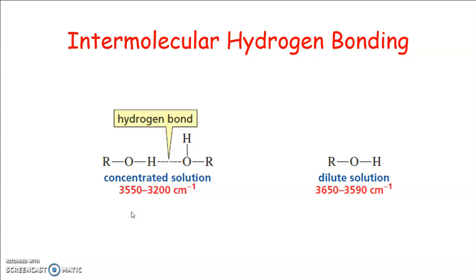Alcohols and phenols in condensed phases are strongly hydrogen bonded, usually in the form of a dynamic polymeric association, and this leads to a wide envelope of absorption and hence broadening of the IR band. Hydrogen bonding involves a lengthening of the original OH bond, which is consequently weakened, and the frequency of absorption decreases.